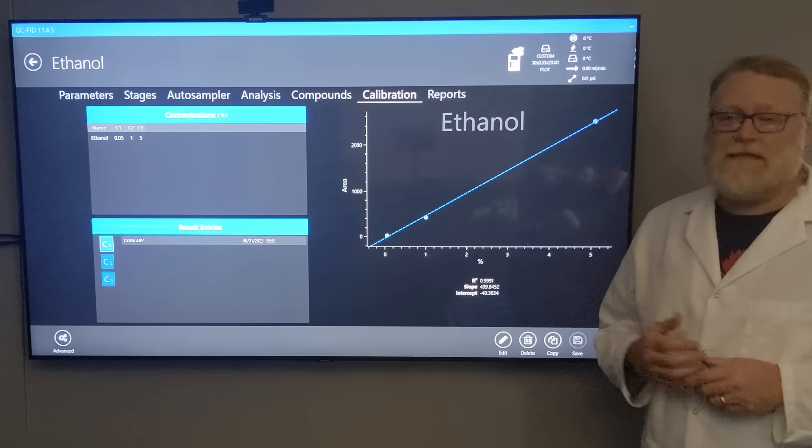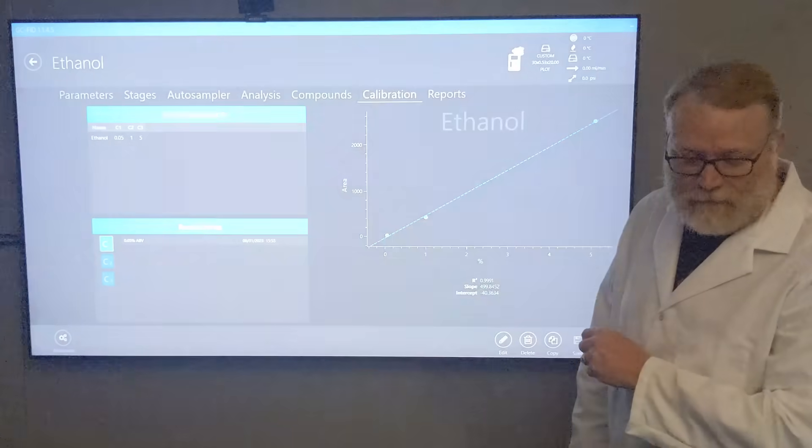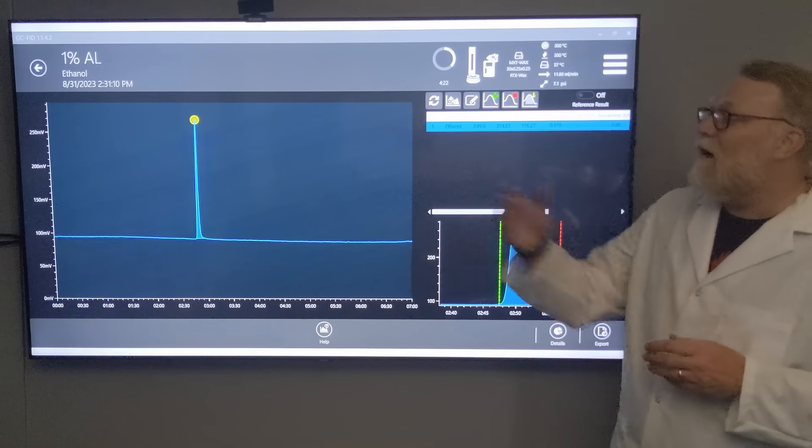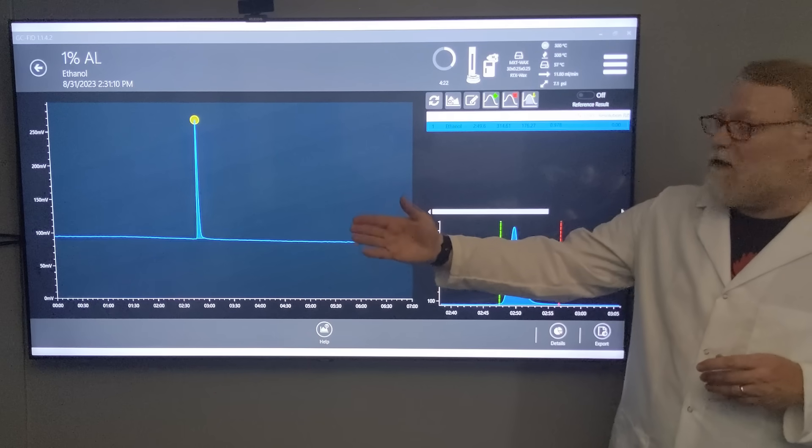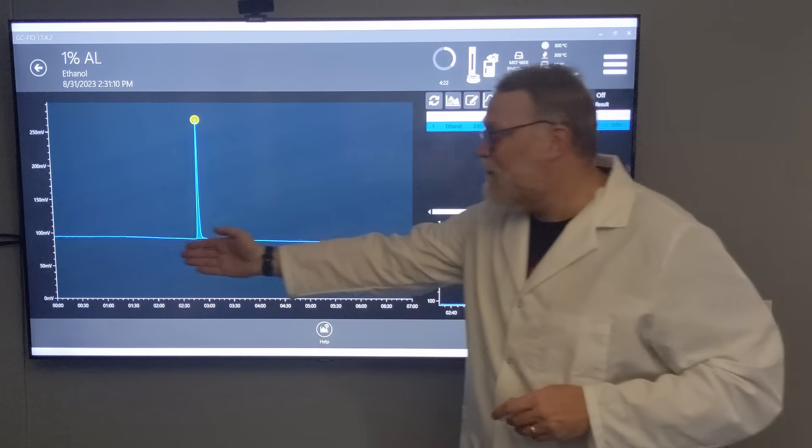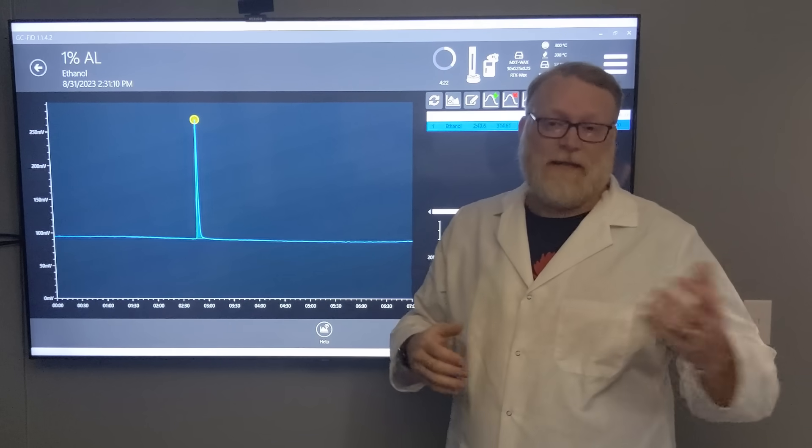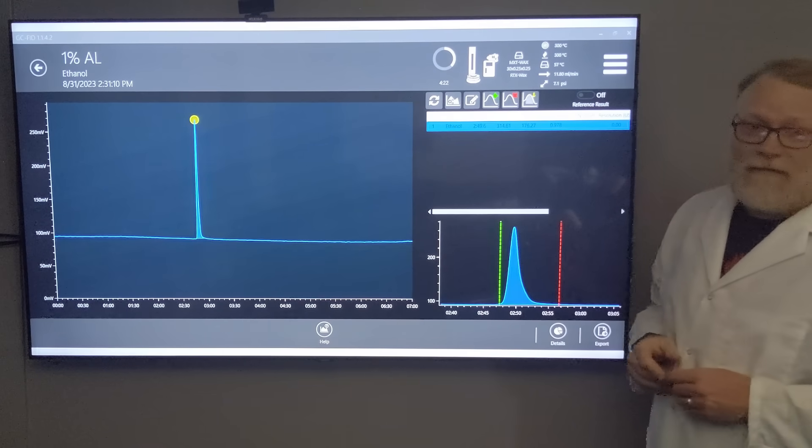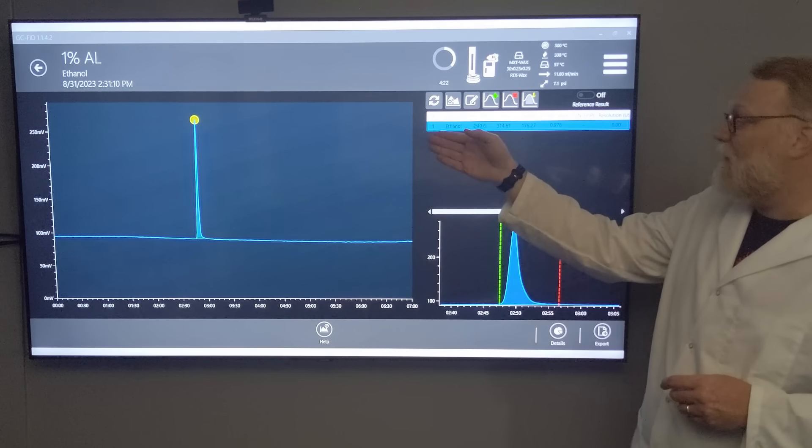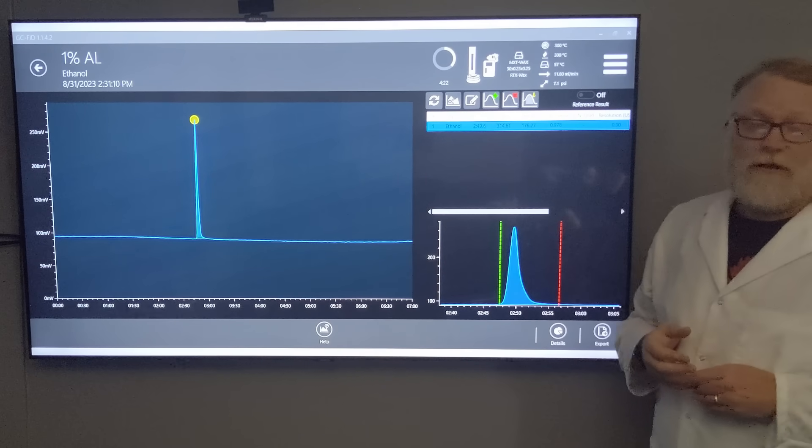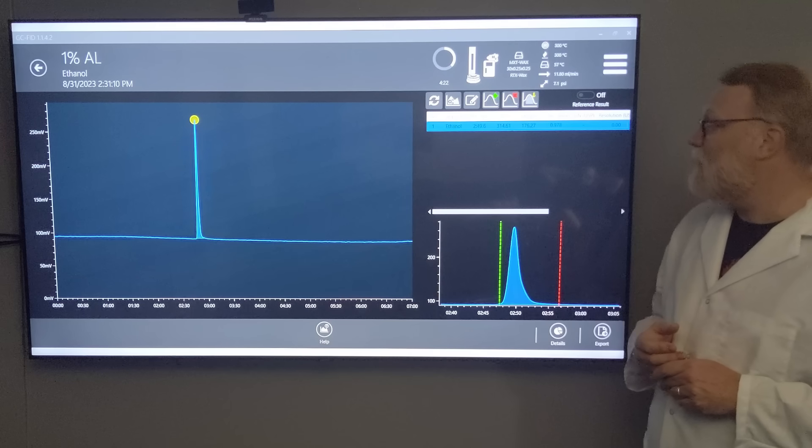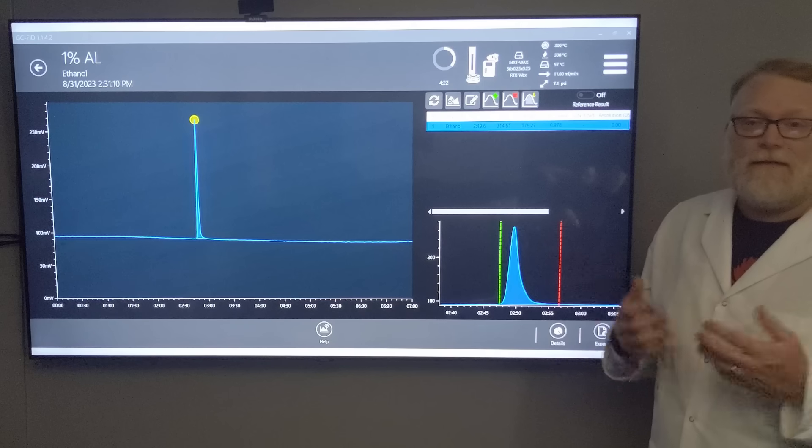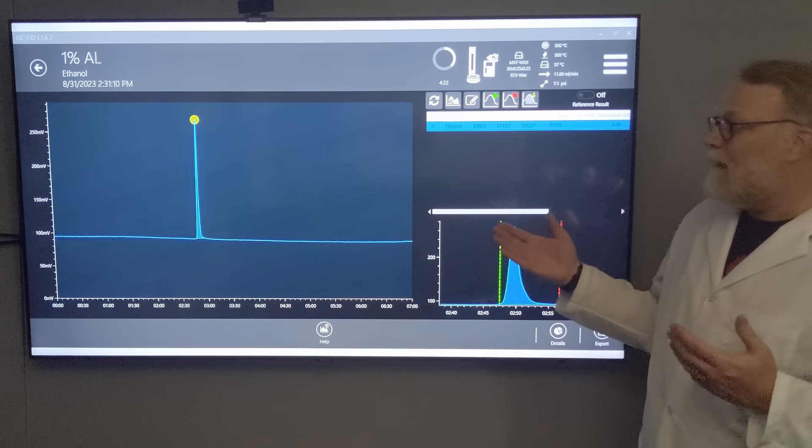Here I've done another injection of an American lager. It gives us a beautiful chromatogram. We know that's ethanol based on our standard - it comes out at the same point, and the software has labeled it as ethanol. It gives us an area of 314.61 and that gives us a concentration of 0.978%.